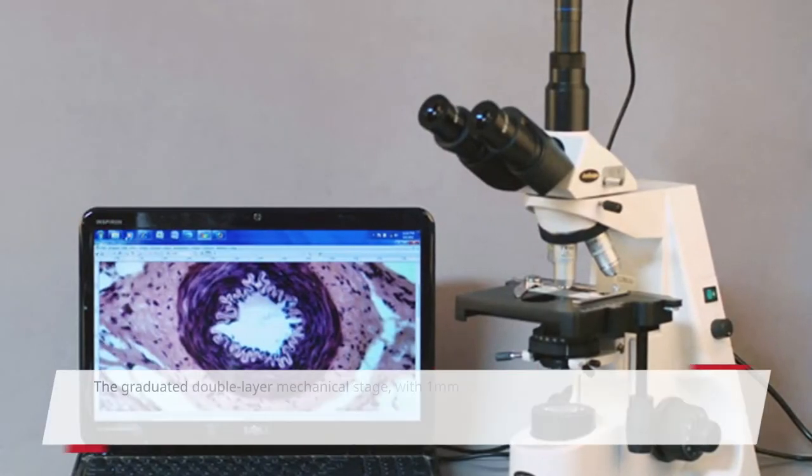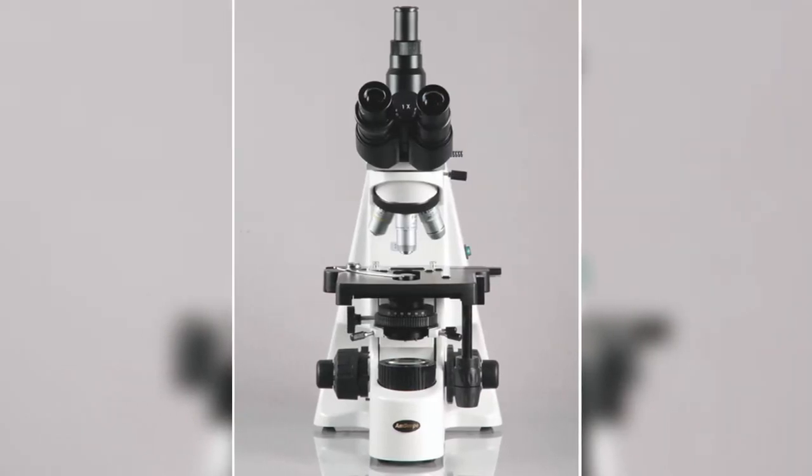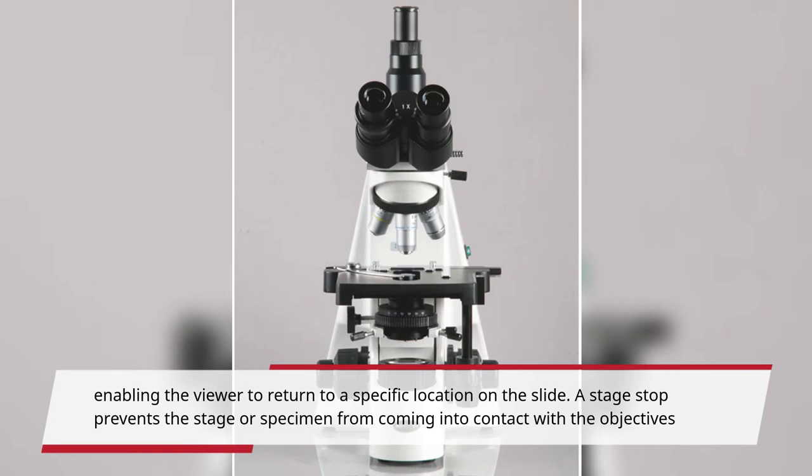The graduated double-layer mechanical stage, with 1mm stage divisions, locks the slide into place and provides precise slide manipulation along the X and Y axis to allow coordinates to be recorded, enabling the viewer to return to a specific location on the slide. A stage stop prevents the stage or specimen from coming into contact with the objectives.